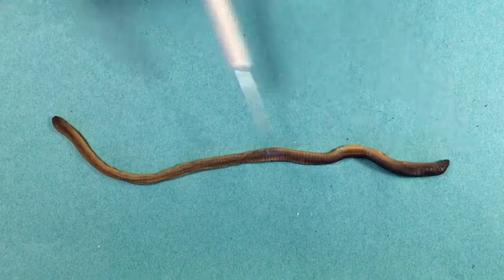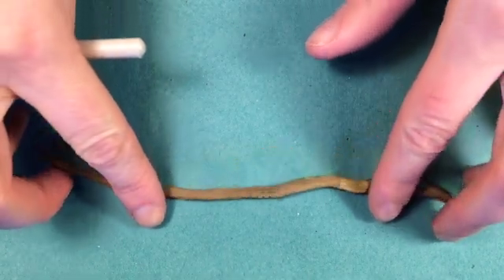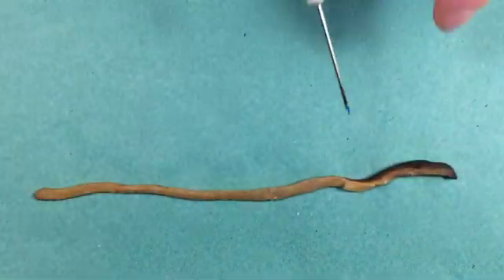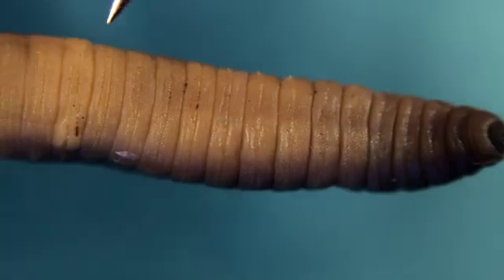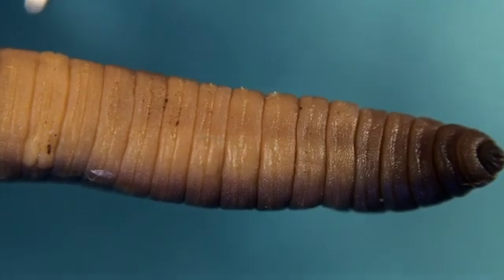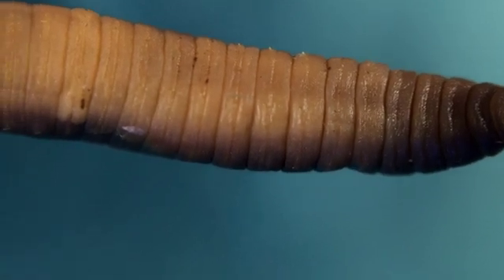Now we know which is the anterior and the posterior end; we need to know which is the dorsal and the ventral surface. If you roll this worm over, we can see that the colour changes — one side is darker than the other. The lighter surface is the ventral surface. Above the clitellum, closer to the head end, are two pores at the level of segment 15. These are the male pores, and it's from here that sperm will be expelled when two worms are mating.